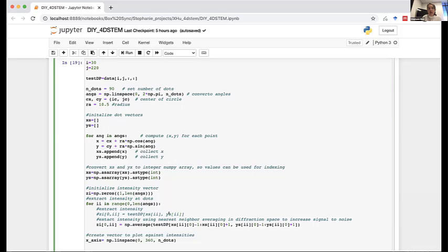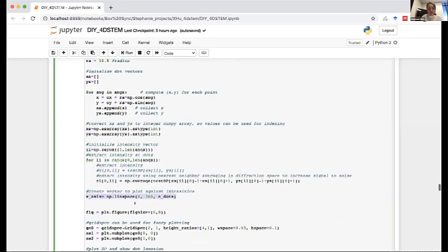But I found that in order to get more robust information, it's actually better to do some nearest neighbor averaging, which I'm going to introduce here. So what I'm doing is I'm taking the average, and I'm taking an area now that's going to be 3 by 3 or 9 nearest neighbor pixels. So each one of those little dots in the map below actually represents 9 pixels. You want to create an x-axis, so you have something to plot against in degrees. And then now we're going to plot.